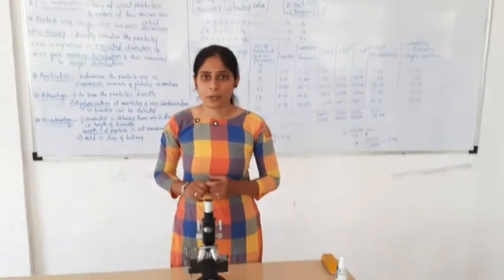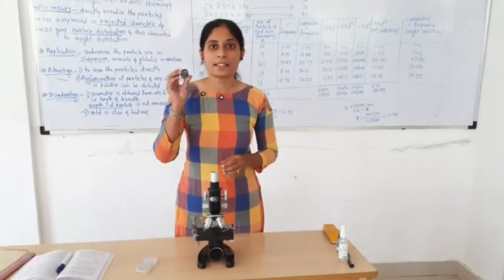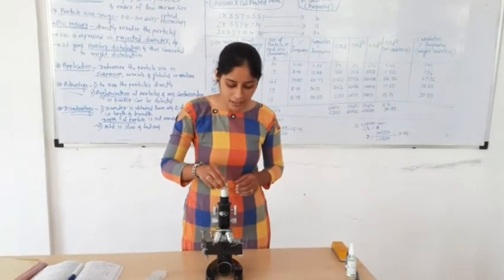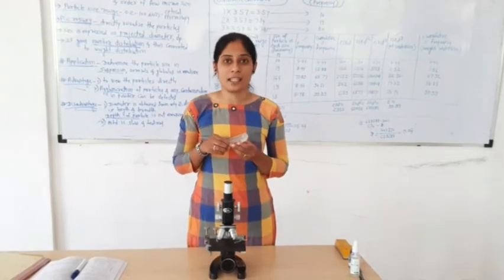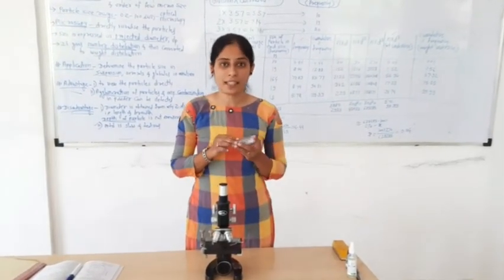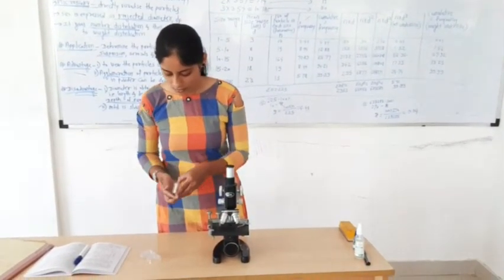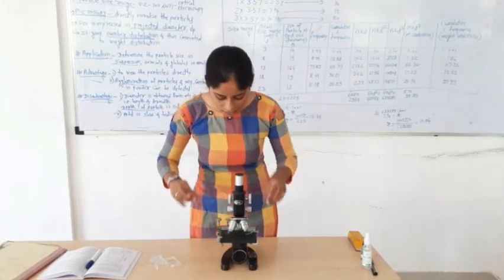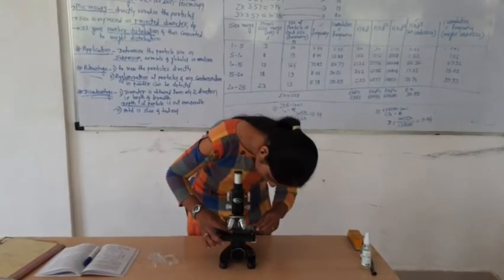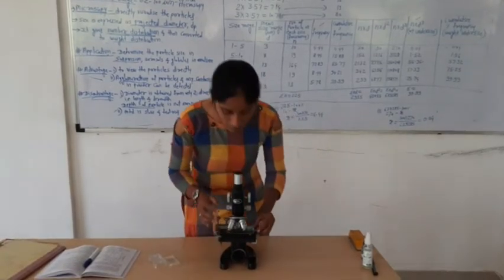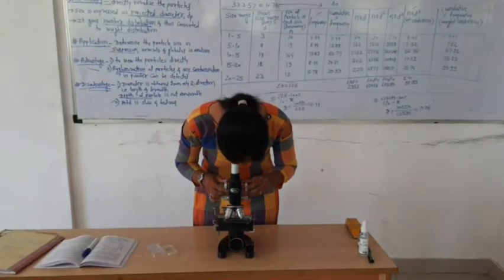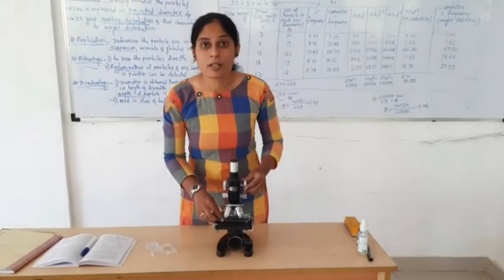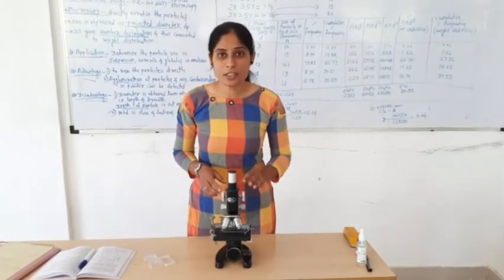For the calibration procedure of the eyepiece micrometer, we use the 10x eyepiece, which contains the eyepiece micrometer scale. We place the stage micrometer scale — which is a 1 millimeter scale — on the stage. The eyepiece micrometer scale is then coincided with the stage micrometer scale, and the calibration procedure is completed.